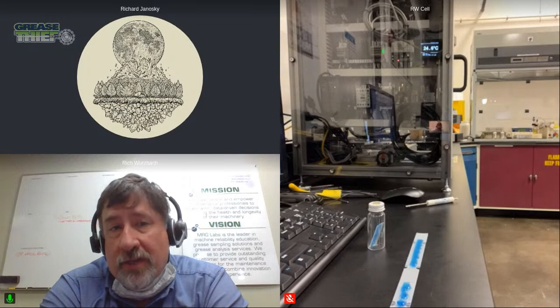Yeah, and for me, that's the real opportunity here. The grease thief technology has been around for a while now, nearly 10 years. But it's not the only way that people are performing grease analysis. Asset owners may be concerned about some critical grease lubricated components, but may be unsure of what kind of information they can get from taking a grease sample and getting it analyzed. They may end up with a lab that has invested in the grease thief technology and has the experience and the training to do that.